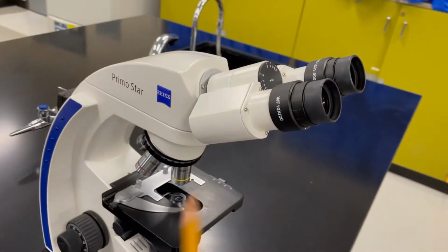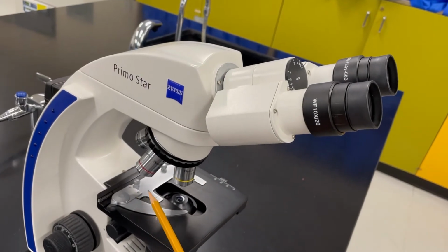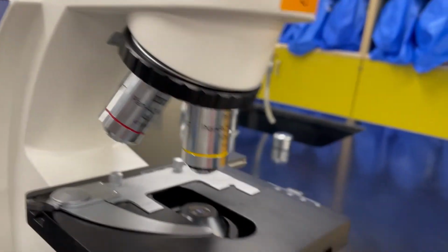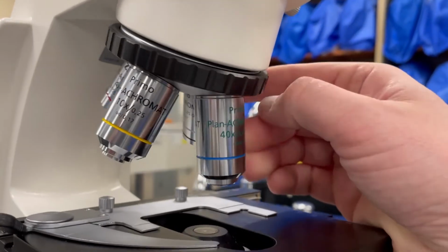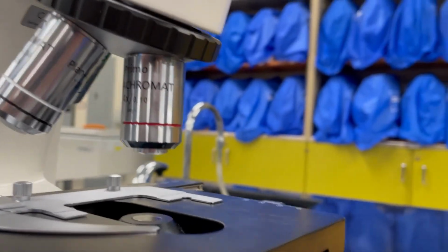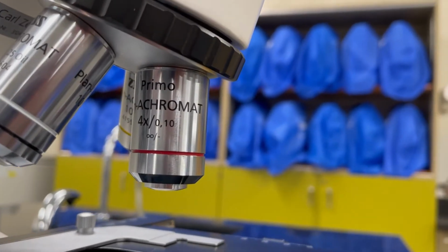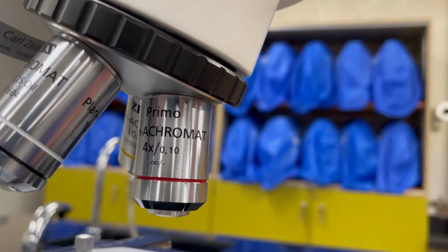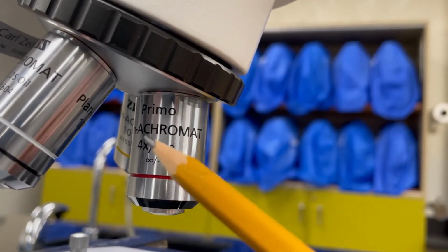If we move down the tube here, down over here we have the objective lenses. So let's go in for a little bit of a closer look. So the objective lenses, you can see that there's 4 different ones, and let's take a look at this one here. This is the 4 times objective lens, so this is the smallest objective lens, and you can see the numbers written on here.